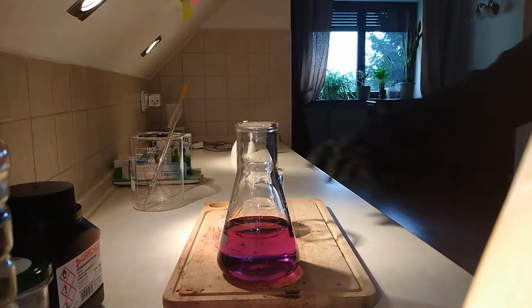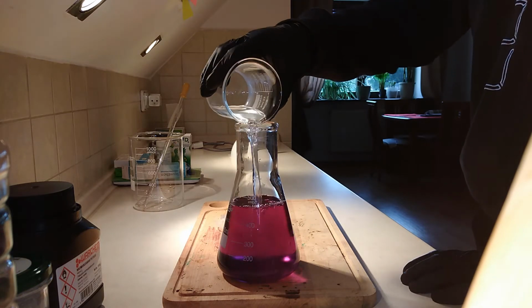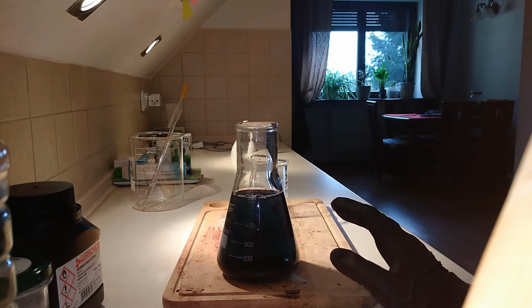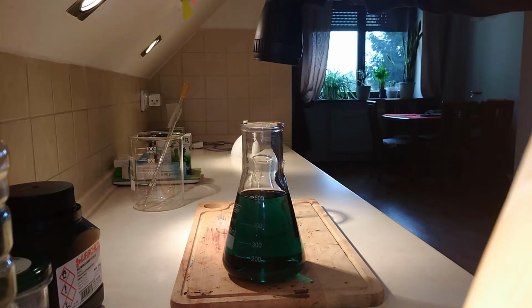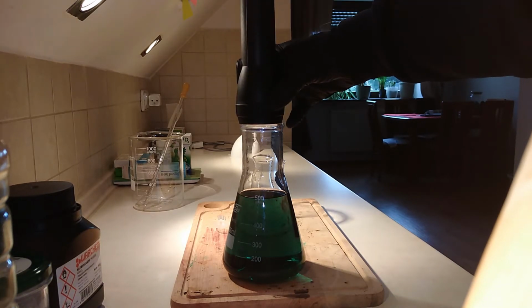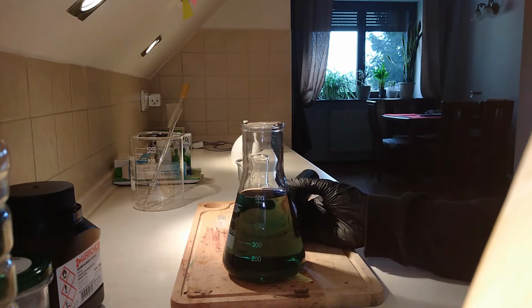Well, let's start the reaction. I'm going to add the sugar solution, and you see it changes color. It gets green. Quickly I'm going to grab my flashlight to show you. It turns green. It's green, and now it will get yellow.